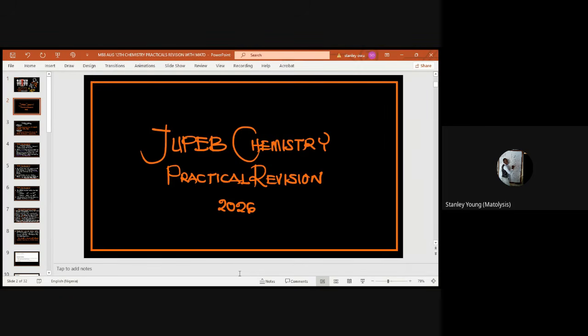And our focus today would be on JUPEB Chemistry Practical Revision 2026. As usual, for JUPEB Chemistry, we have two questions. One from quantitative analysis, which you can also call the volumetric analysis, though volumetric analysis is a portion under quantitative analysis.